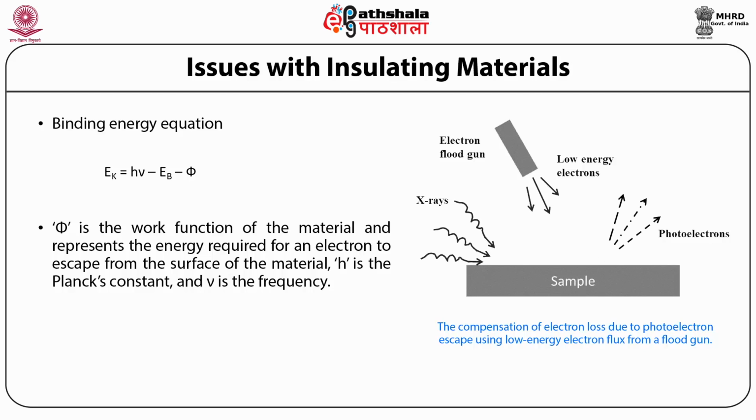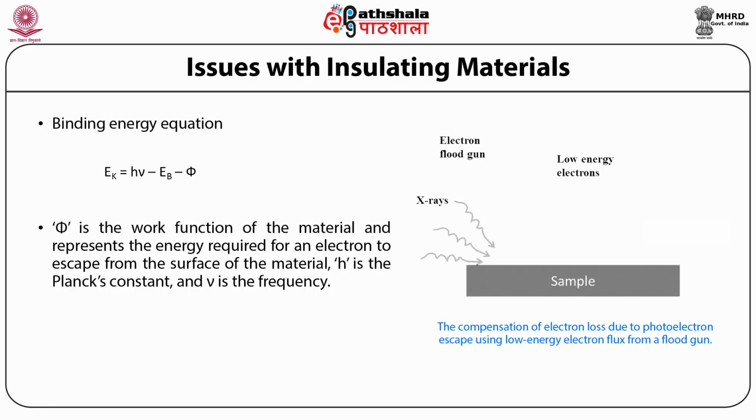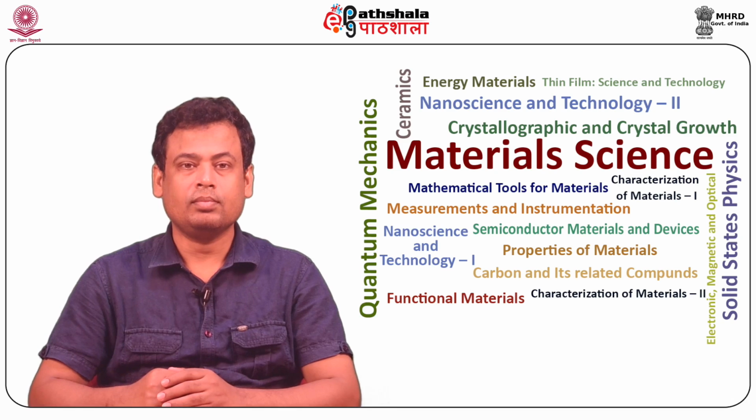Hence, use of non-monochromatic X-rays has the identical effect as using an electron gun.